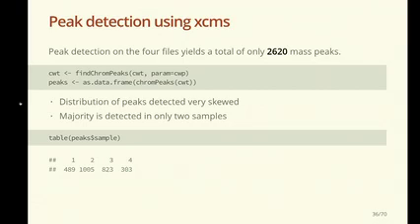So that already shows that there's something lacking. They were not detecting the peaks, while they should be there. So probably through tuning of some parameters in XCMS, you can achieve a slightly better result, but I've not been able to do so to a very large extent. But if there's anyone who can correct me, I would gladly know.